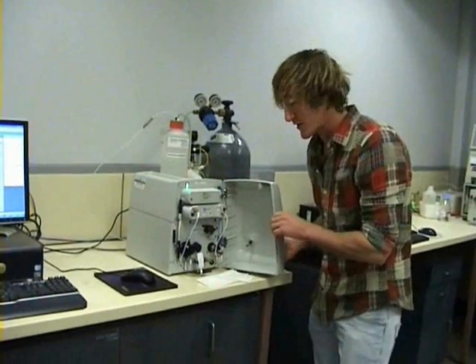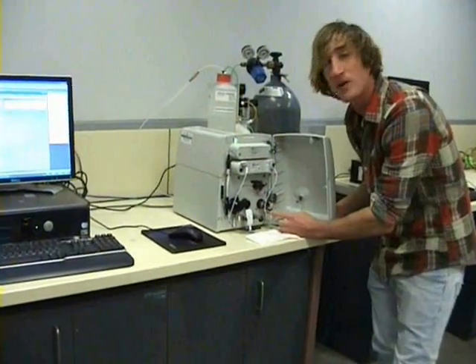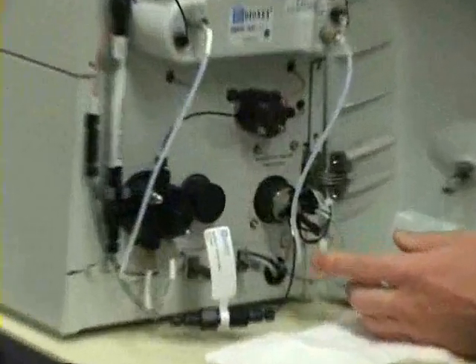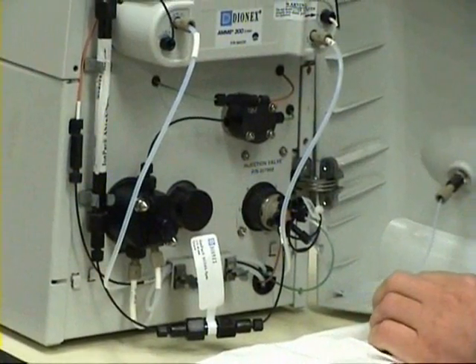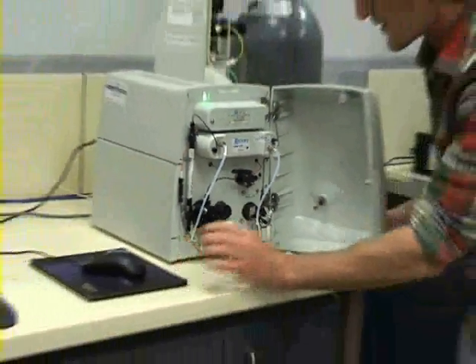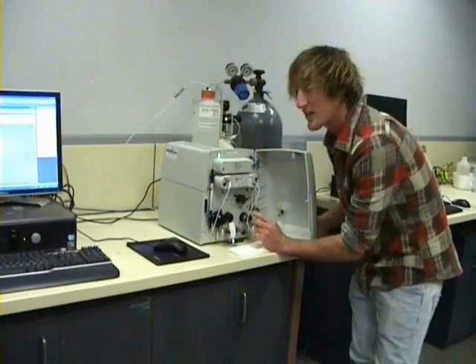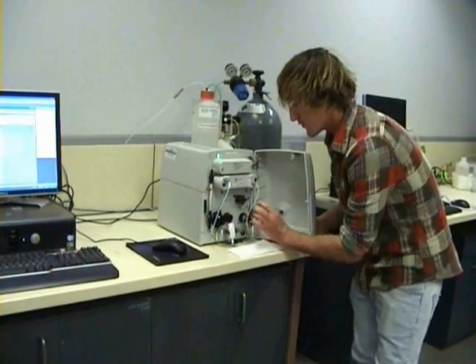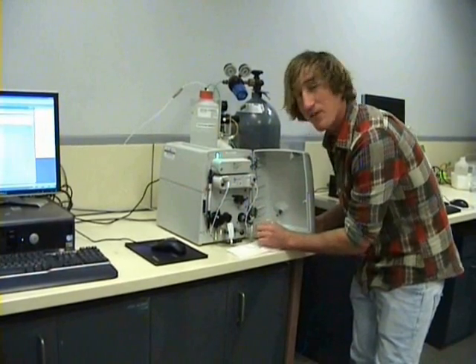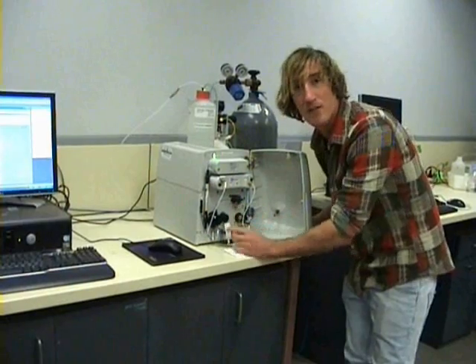Once we inject our one-millilitre solution, it moves on to our injection loop. For this system we use a 10-microlitre injection loop, which means that only 1% of our one-millilitre sample is retained in this loop. While the system is in the load position, the mobile phase is bypassing this injection loop. Once we click Inject on the software program, it opens a small valve so that the mobile phase passes onto the injection loop, pushing our sample further onto the chromatographic column.